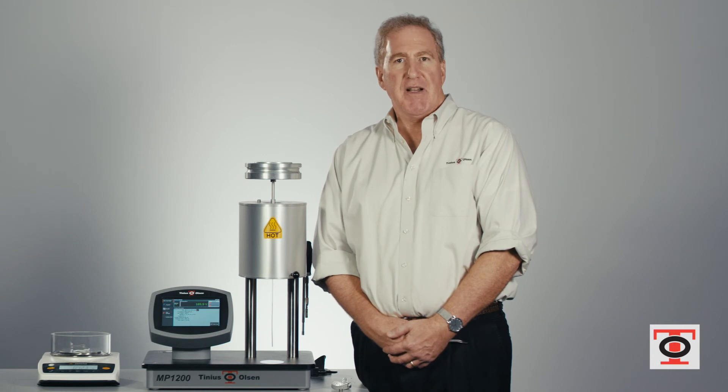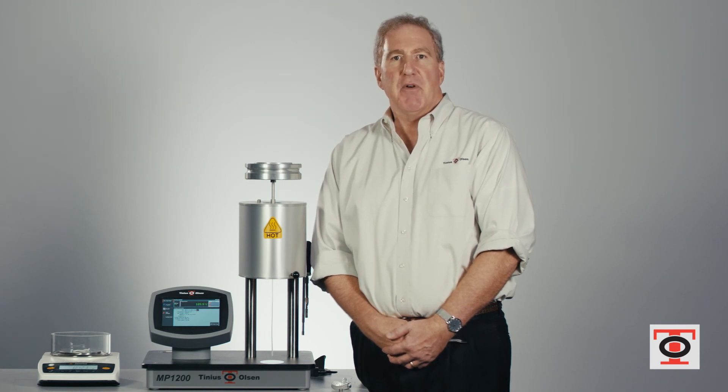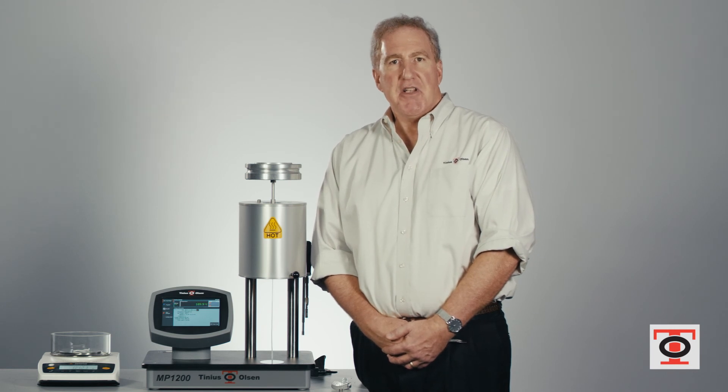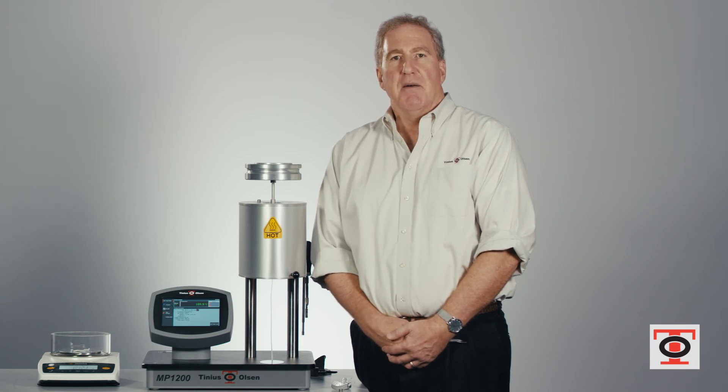The machine will store the last 25 tests that you ran. The other option you have is to print it — we supply a printer that works with the MP1200 system. We also provide each MP1200 with a PDF writer installed on the machine so you can print out your report to a USB key and take it to any other computer and print a hard copy out.